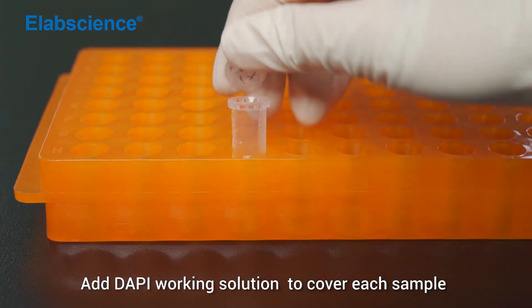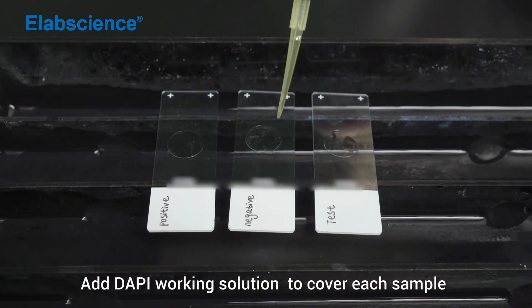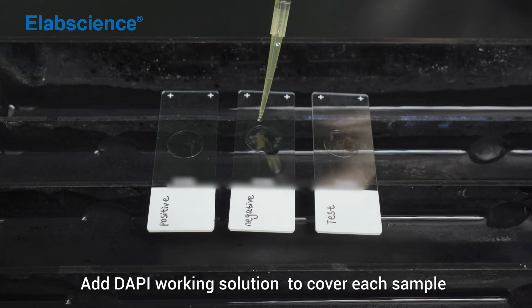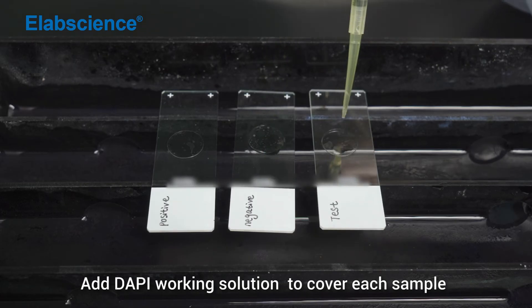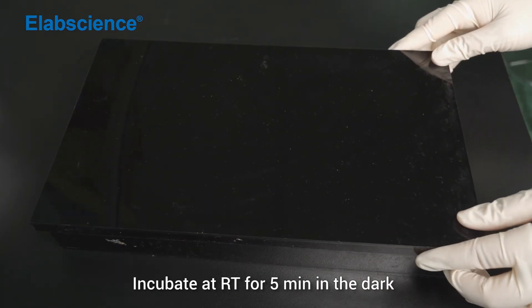Add DAPI working solution to cover each sample. Incubate at room temperature for 5 minutes in the dark.